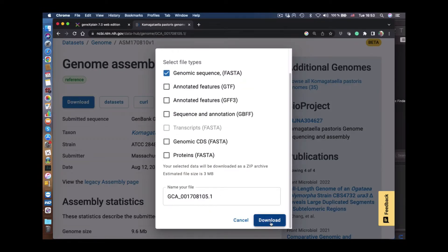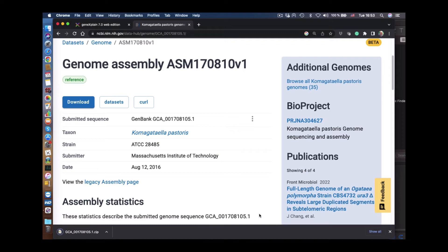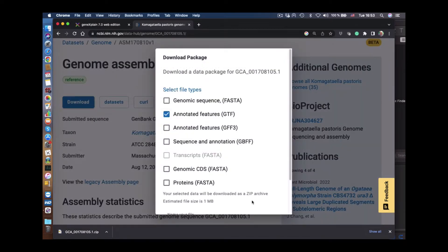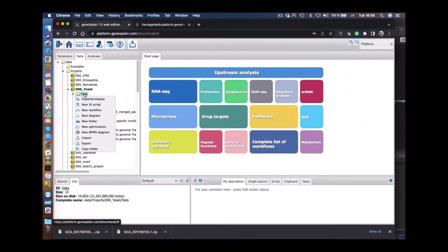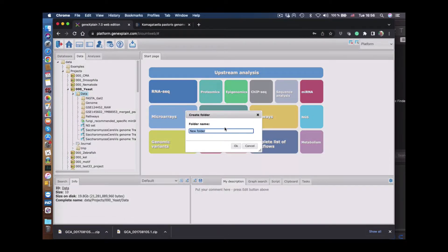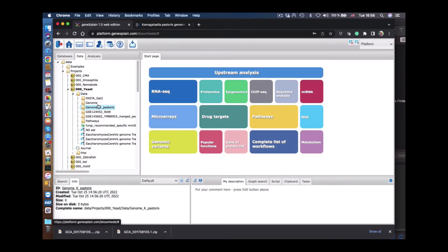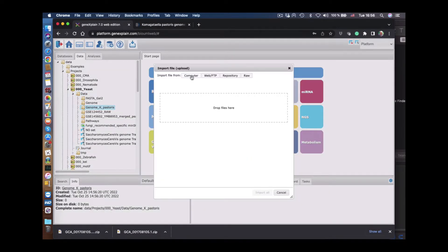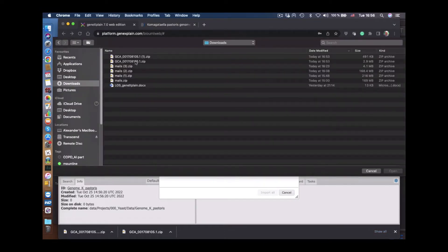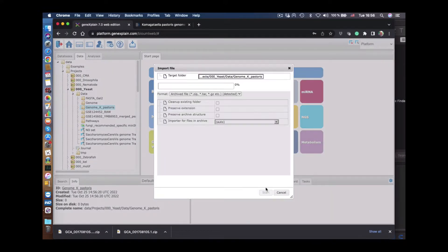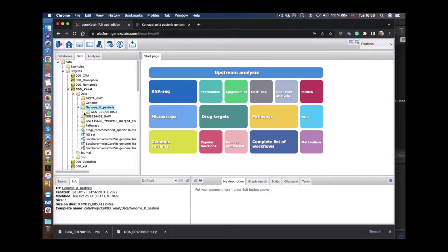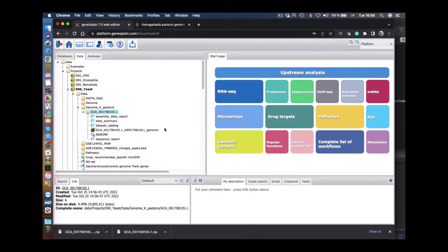First we download the FASTA formatted genome and then we download the annotation features, the gene annotation. Then we go to the platform and create a new folder for the genome of Camagatella pastories. First we upload this genome from the computer, and the system opens the zip file and downloads the FASTA formatted file of the whole genome of that organism.